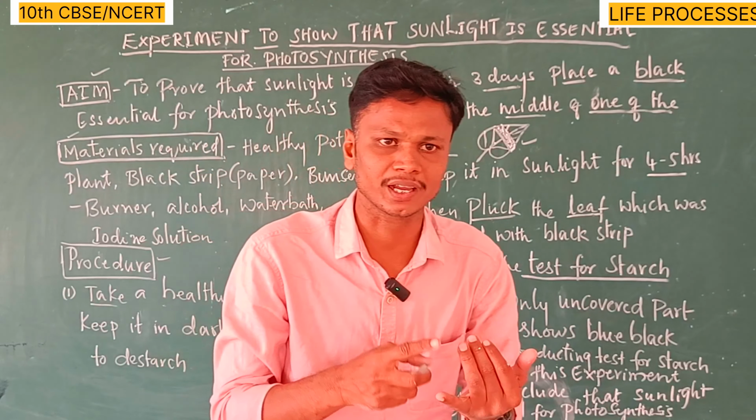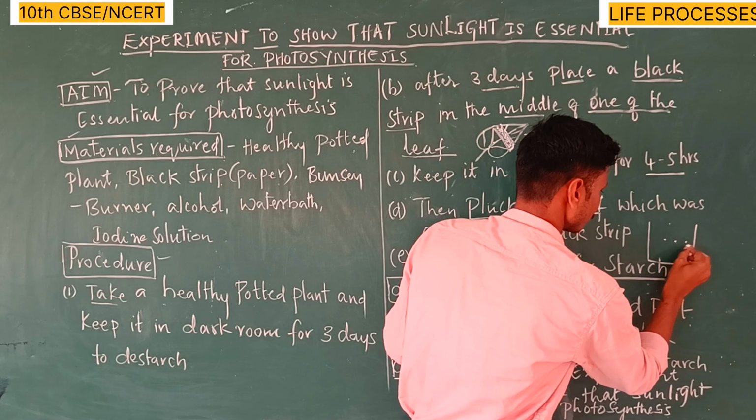In the last video we discussed how to conduct the test for starch. Again, for those who are watching only this video for the first time, I will explain once again. So what you have to do is boil this leaf in a water bath.